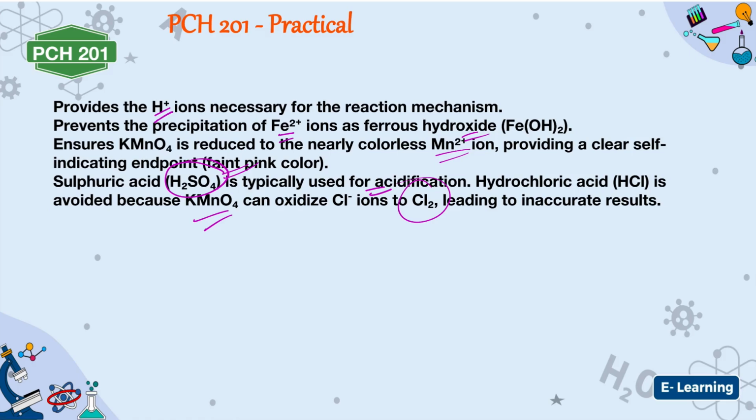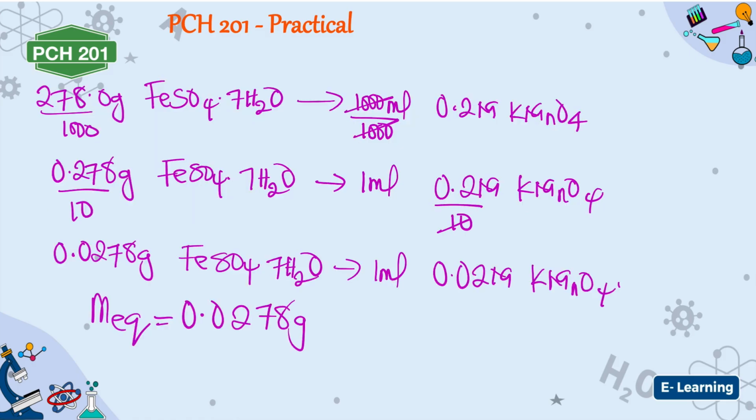All right. Then another thing you should also know is the assay of aspirin. Go and know it. I haven't done practical on that one before. The assay of aspirin, acetylsalicylic acid, which is back titration. Are you getting it? Back titration.